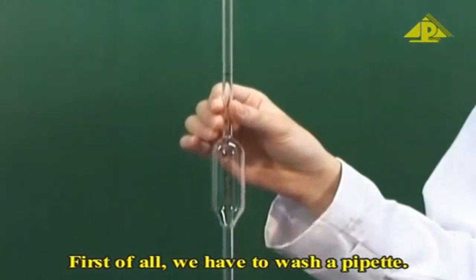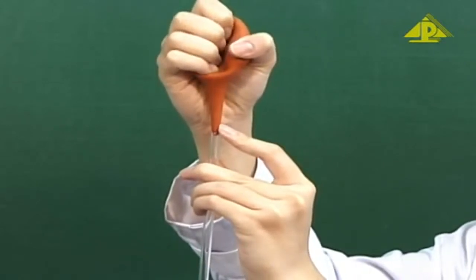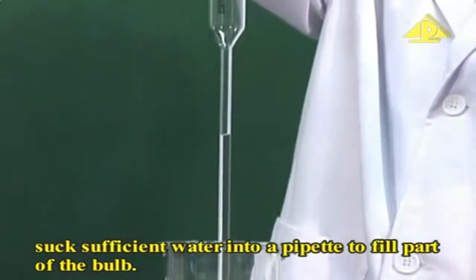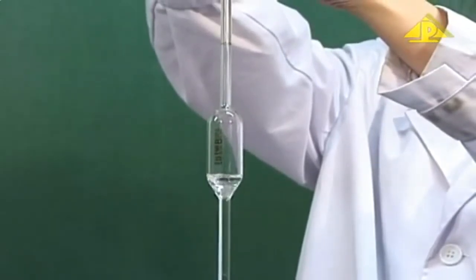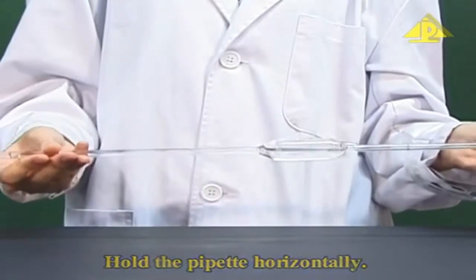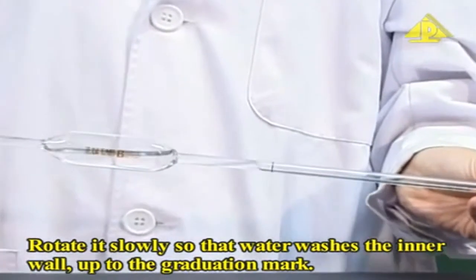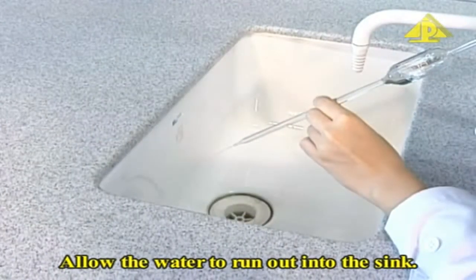First of all, we have to wash a pipette. Using a pipette filler, suck sufficient water into a pipette to fill part of the bulb. Hold the pipette horizontally. Rotate it slowly so that water washes the inner wall up to the graduation mark. Allow the water to run out into the sink.